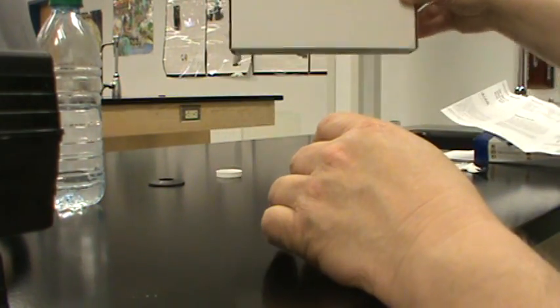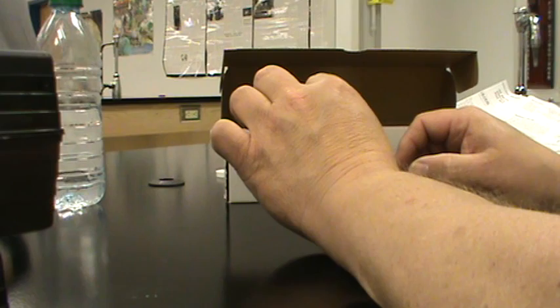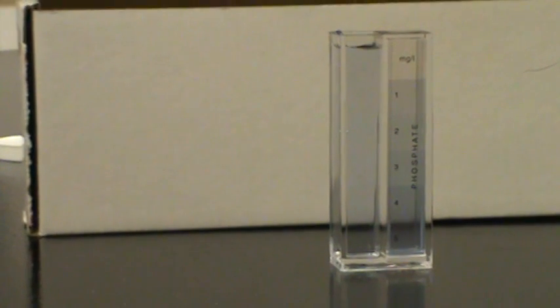Let me set this box up here so we have some kind of background to compare it with. We're going to fill this side with our water that has reacted with the phosphates. We're going to fill it up even, fill it all the way. Let's see what we got here. Let me go ahead and zoom this in a little bit so you can see it a little better. You can see that pretty good.